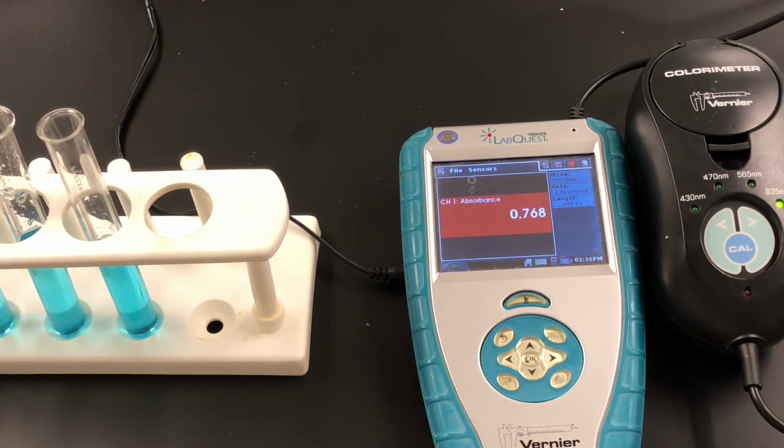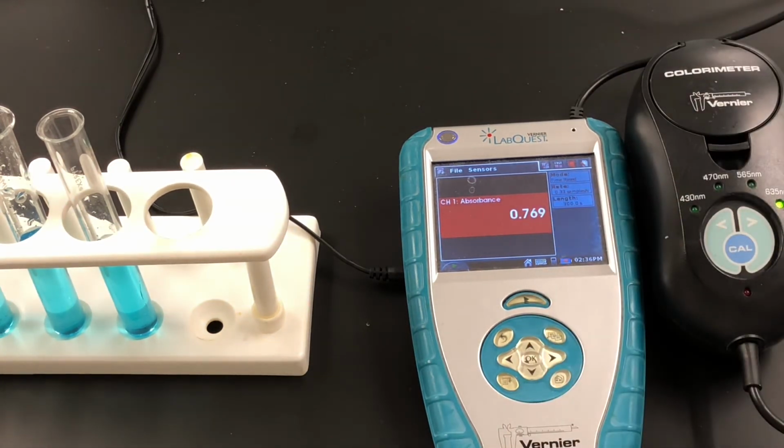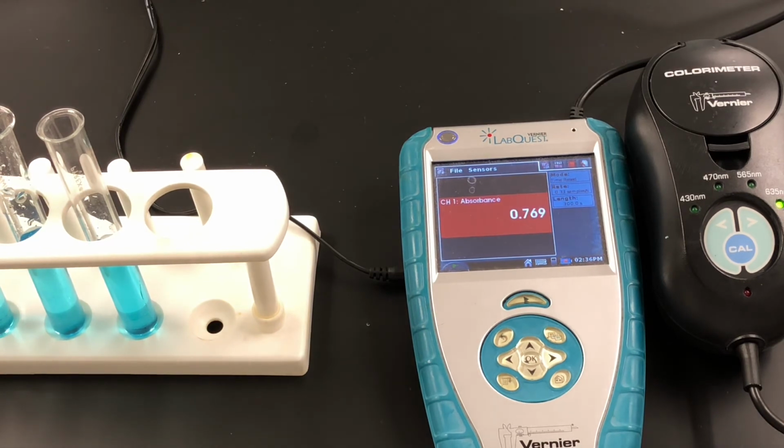Yeah, this looks better. You know what could have happened was this one had so much that went in. It was 8 milliliters and then 2 water on top. And I put the 8 in first, and it's more dense, so it might not have mixed. I don't remember if I swirled it around. I don't think I did. I like this number better. So we're going to go ahead and change trial number 4 to this one. It's either that or I did the same test tube twice, which is a possibility, but it's definitely less than number 5. So 7, 6, 9.